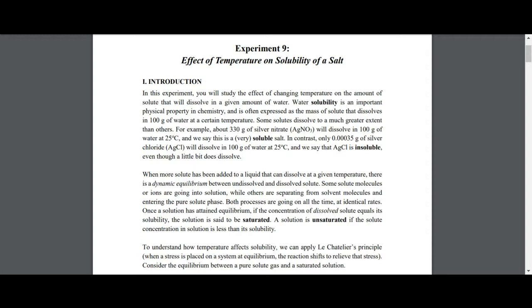That's how they make crystals. They make a supersaturated solution at a high temperature, and then they cool down the temperature. When you cool it down, those crystals start coming back. If you give enough time, the crystals are going to stack over one another, and it gives you a nice shape of crystals. But if you cool it down suddenly, 6 grams of NaCl is going to remain as a solid in that mixture, because not everything is going to go into the solution.